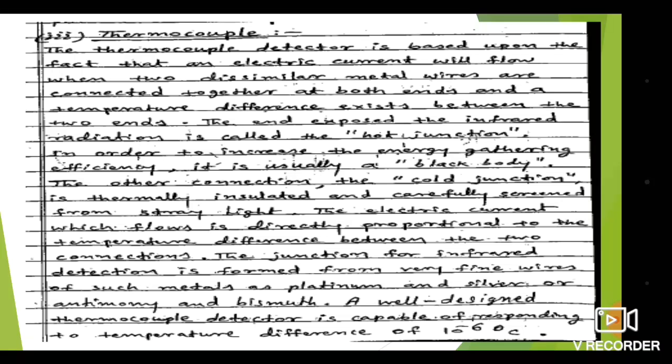So two connections or two ends. The junction for the infrared detection is formed from very fine wires of such metals as platinum and silver, or antimony and bismuth. A well designed thermocouple detector is capable of responding to a temperature difference of about 10 to the power minus 6 degrees Celsius.